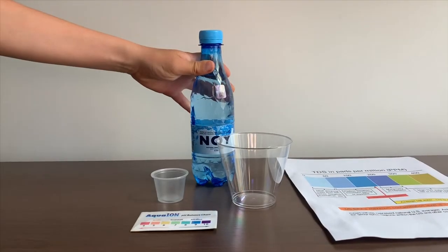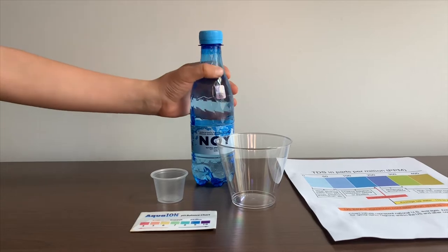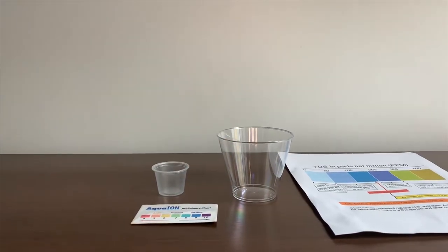This is NOI non-carbonated spring water. We got it from Armenia. Let's test the pH and TDS levels.